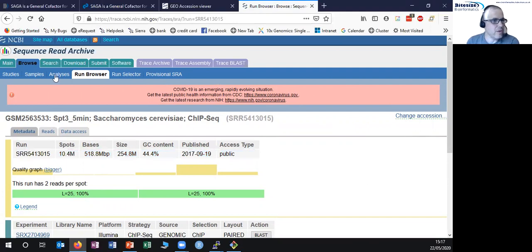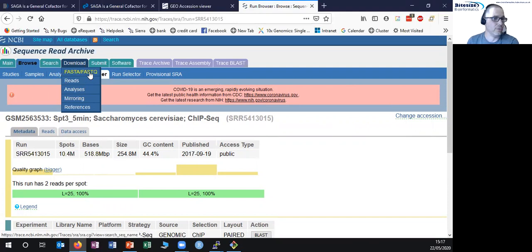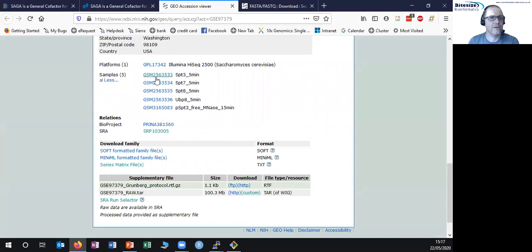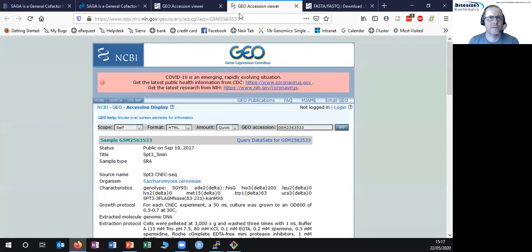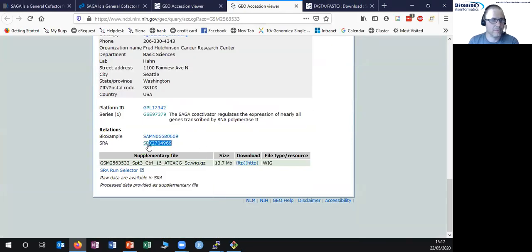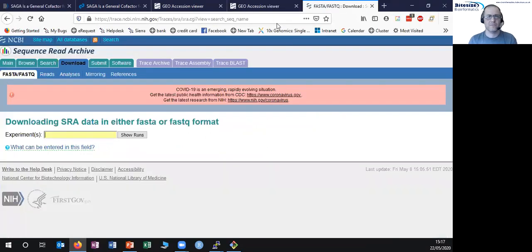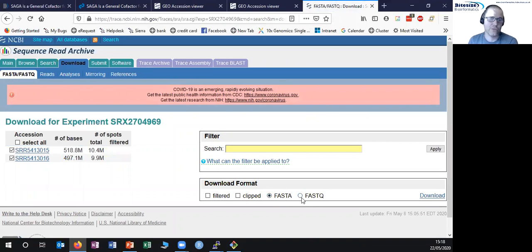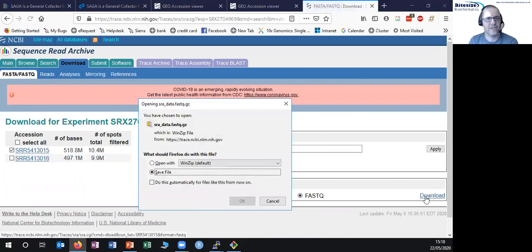Now that we're on a particular run, there is a download link at the top that says 'Download FASTQ,' which is exactly what we want — that would appear to be a nice way to get at this. Unfortunately if you click on that, despite the fact that we're already in a particular run, all you get is dumped into a search box where you can't even put the run identifier in. What you need to put in at this stage is the experiment — the SRX number. So if I go back and find the SRX number and put that into the download search box, it gives me the list of files and asks what format I want. FASTQ is not the default, but I can make it FASTQ, pick a file, say yes, and it gives me a file to download.